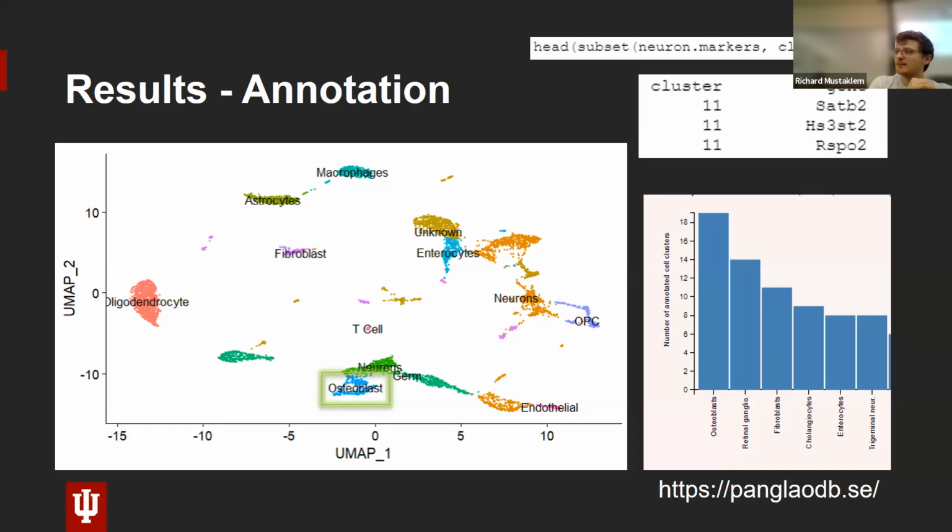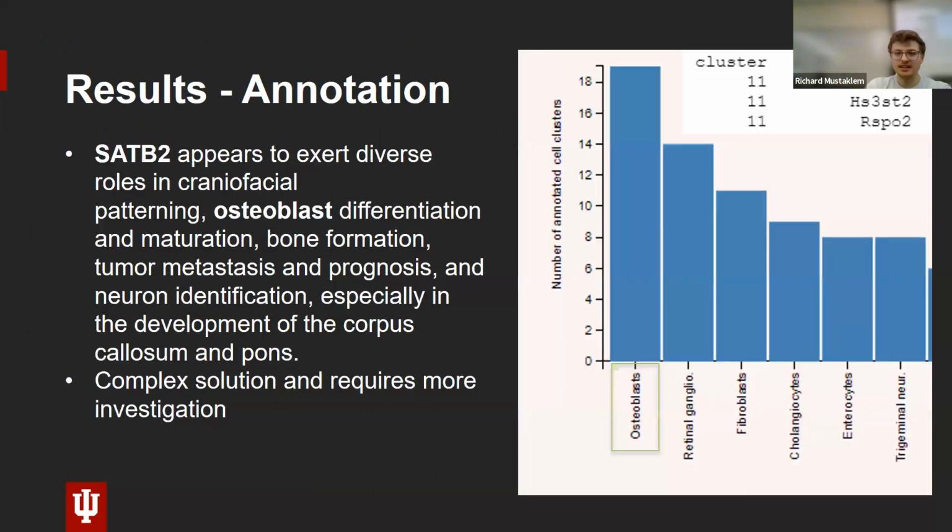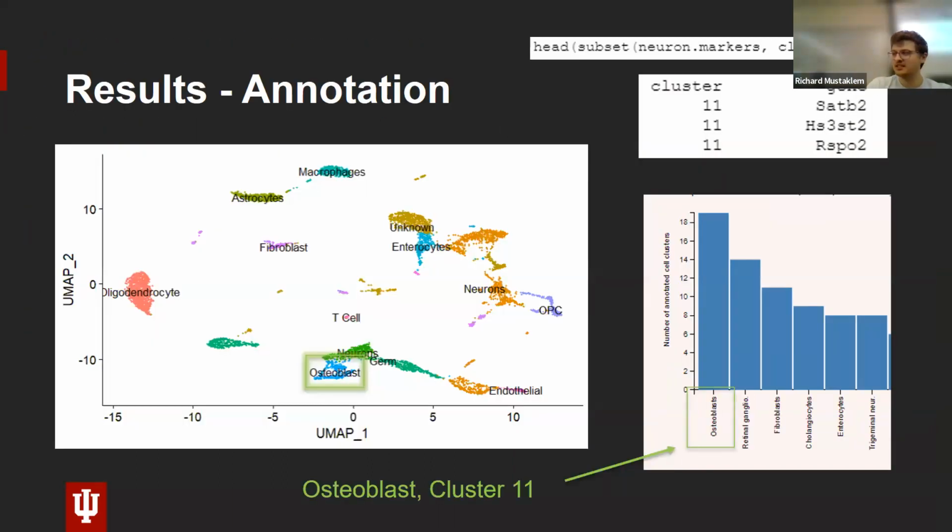Is this oligodendrocyte population close to other cell types? Is it not? These are things you want to be thinking about. And then you can draw your conclusions from that. Like, oligodendrocytes were really weird. We should probably investigate those. But that was a really good point that you made, and I do need to look into that further.